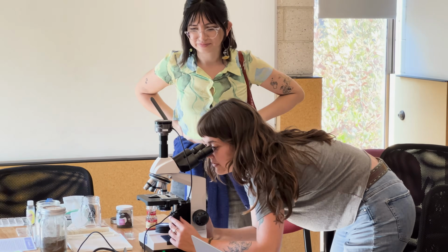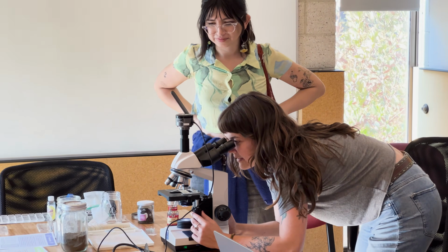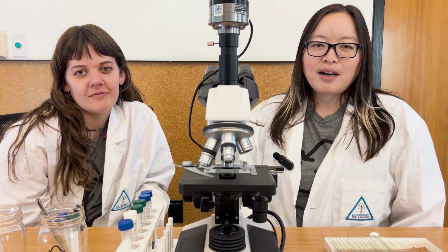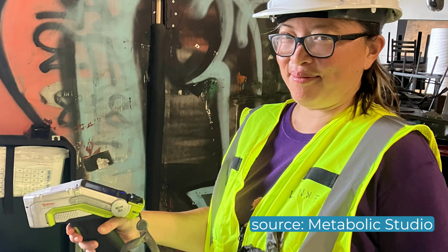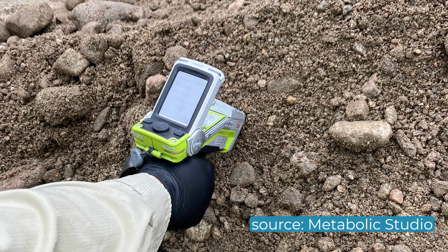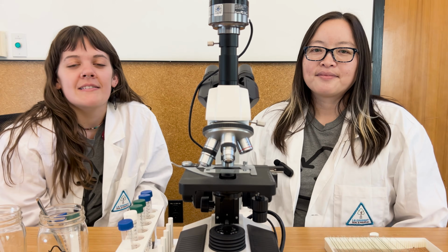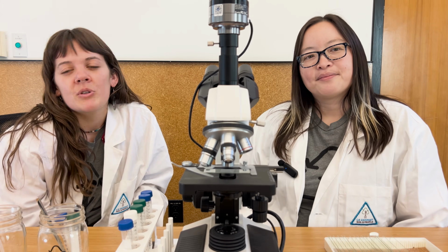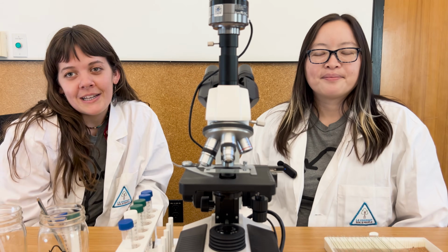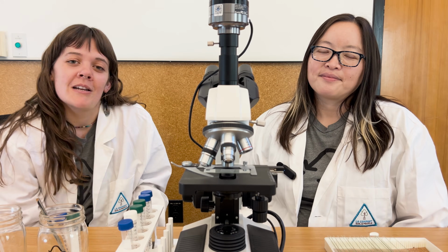Microscopy can teach us a lot, but it's important to understand that this type of microscopy will not always tell you the exact species of the organisms you're viewing, and you will not be able to assess the presence of heavy metals. To learn more about these topics, you may need to explore other lab options, such as DNA sequencing or an XRF analyzer. There's also more quantitative analysis, such as counting organisms or extracting specific groups of organisms from a sample, which require more specific laboratory tools and equipment to do. Our approach is simple, accessible, and qualitative for the practical soil maker to be able to adjust and fine-tune their process.